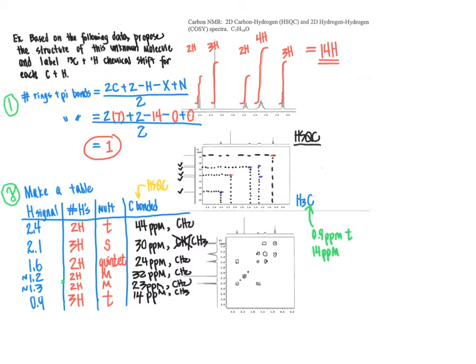And so keeping in mind that this proton set represents a triplet, that indicates to us that there have to be 2 hydrogen atoms next door. There have to be 2 vicinal hydrogens. And the only way I can think of to do that is to create a CH2 group here. So if we create a CH2 group here, so we have our CH3, if there's 2 vicinal hydrogens, N+1 rule would be 2 plus 1 makes 3, meaning this signal would be a triplet.